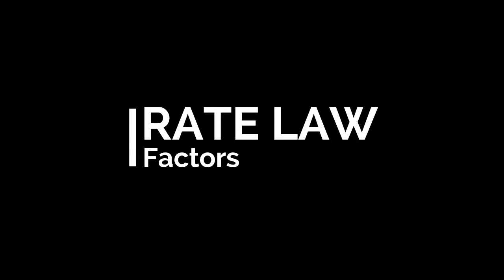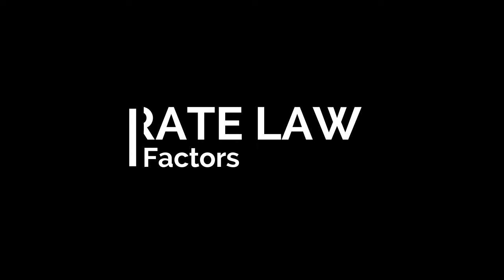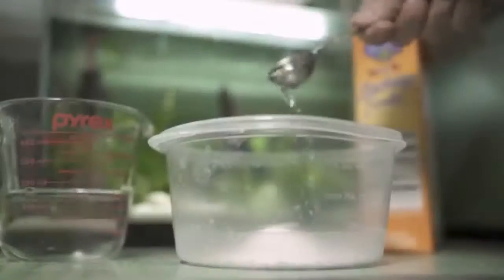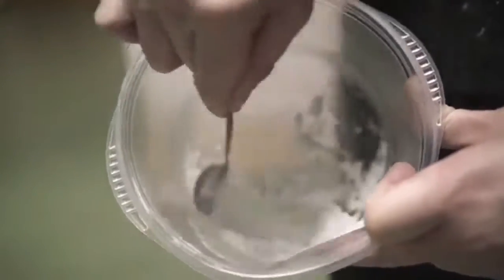Rate law is basic knowledge among chemistry students. Basically, in rate law, there are several factors that affect the rate of reaction. Those factors are concentration, temperature, different reactants, and surface area. In this video, we are going to focus on the rate of reaction between vinegar and sodium bicarbonate according to those factors that have been stated just now.